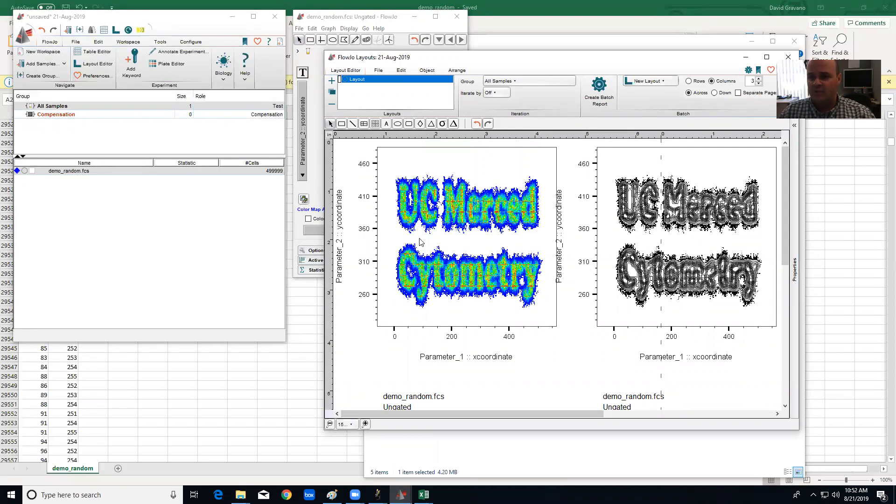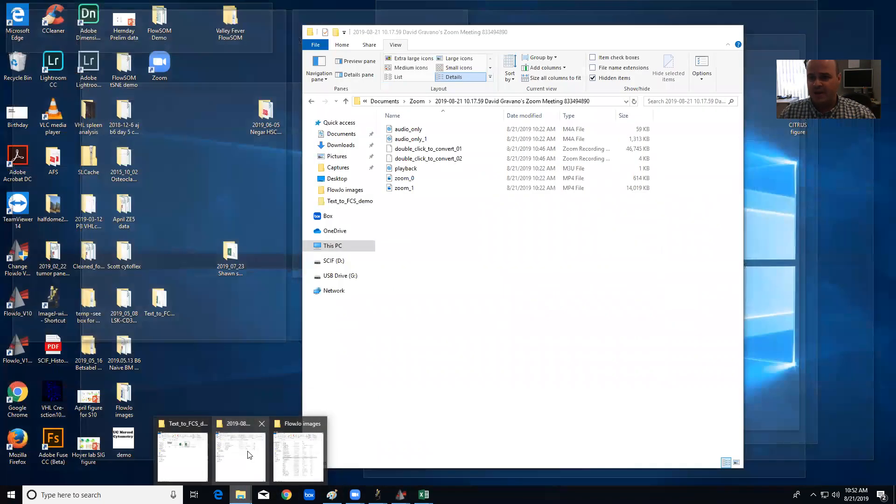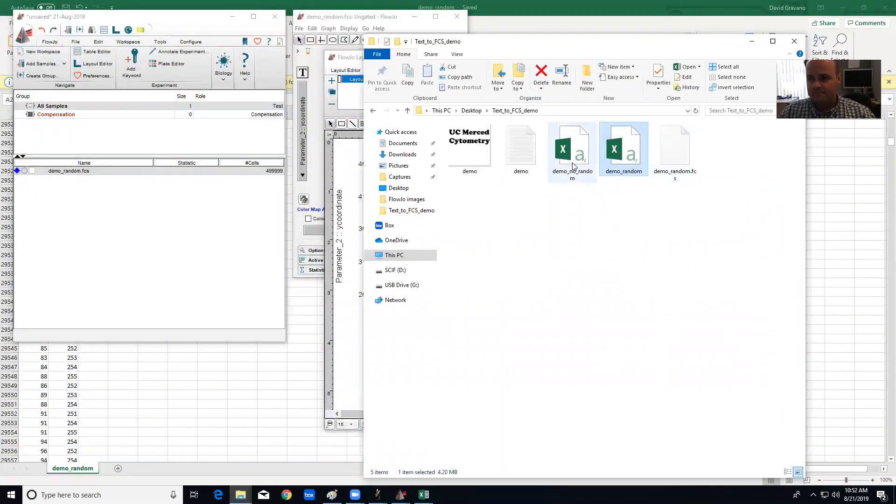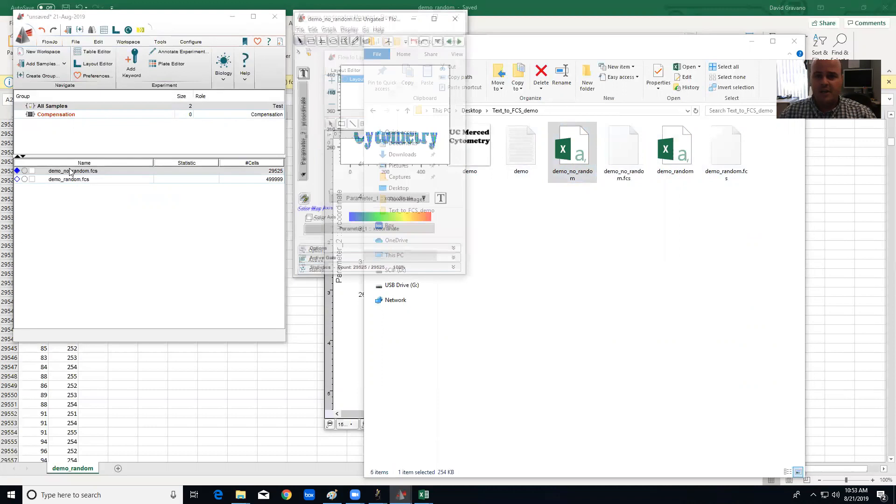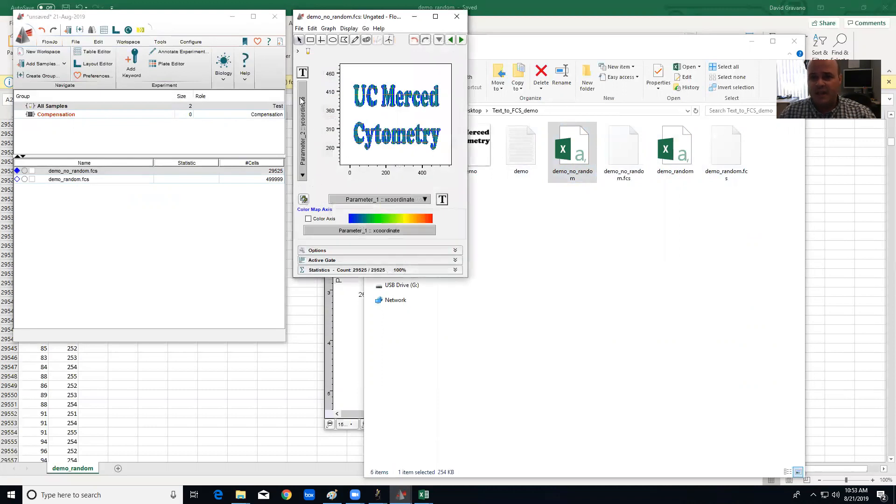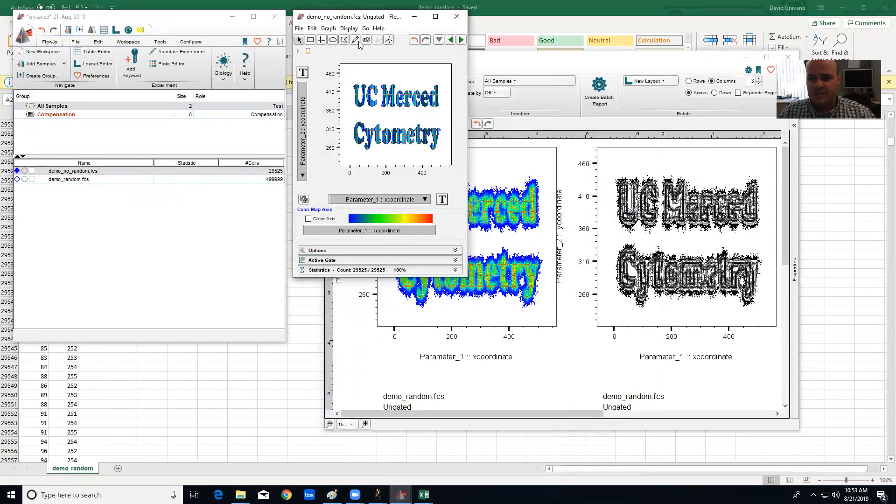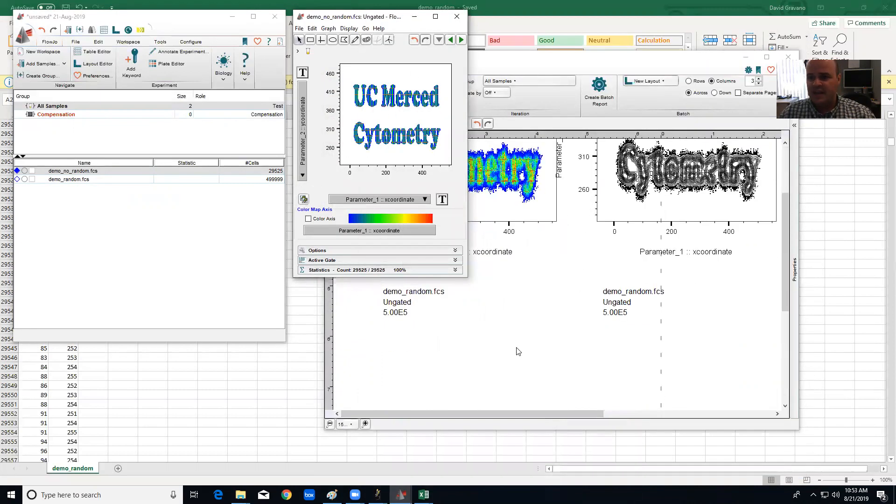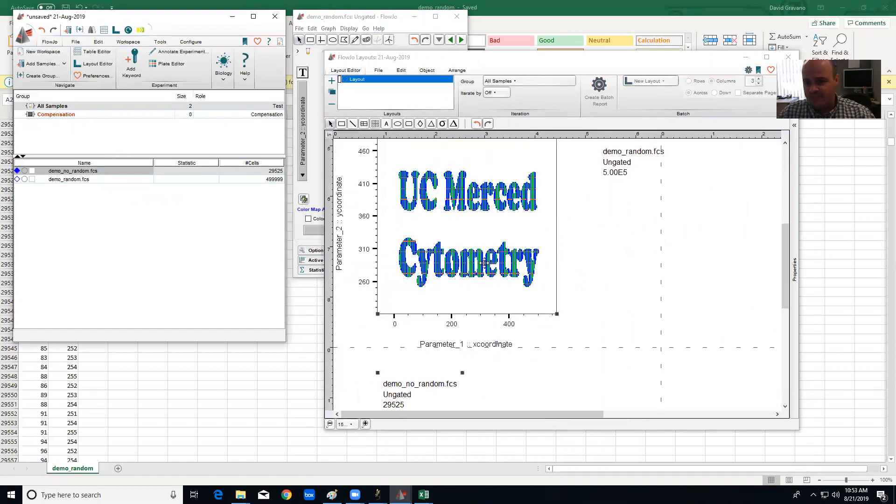And let me drag in what it would look like if you didn't introduce those random numbers. So with no random, if I click on that, what you're going to see is it's not going to look quite as appealing. It's not going to have that appearance of flow data with the outliers.